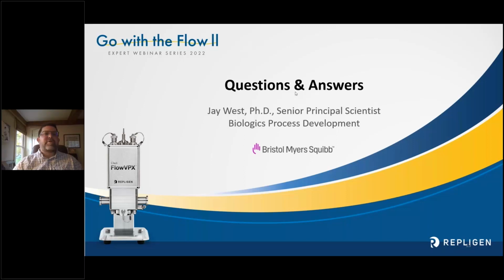Like I said, in 2017, 2018, I was put in charge of the flow and the solo VPE projects, especially because they were a little unusual, being PAT projects, and we didn't really have any PAT at the time. The PAT initially was just to accelerate process development, but now it's potentially accelerating manufacturing as well.